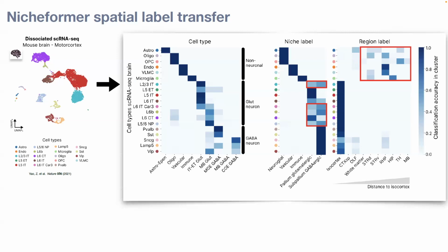There's a reason for it, and that is the Allen Brain Atlas with 4.3 million cells that we used during training, and the targeted panel they used is really focused on the GLUT neurons and the GABA neurons. They have barely any markers on the non-neuronal cells, just a few to identify cell types. So we assume that for the large model, it's hard to place these cell types correctly into their spatial context.